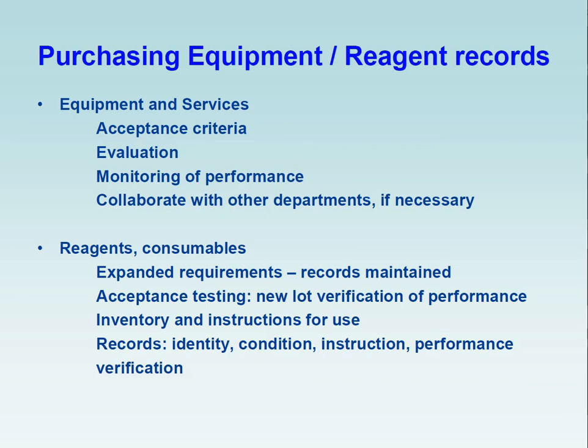If you take a new piece of equipment, you buy a new flow cytometer, how are you going to validate that that flow cytometer works? Some of the acceptance criteria have already been published by the companies, but by other people. And you can use that as part of the evidence. So you would not necessarily have to do a full verification. You could just verify against those standards.